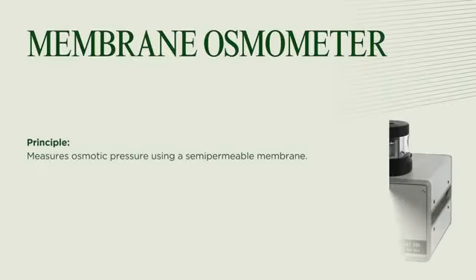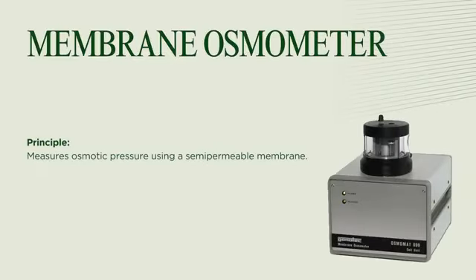Moving on to the membrane osmometer. It measures osmotic pressure using a semi-permeable membrane.